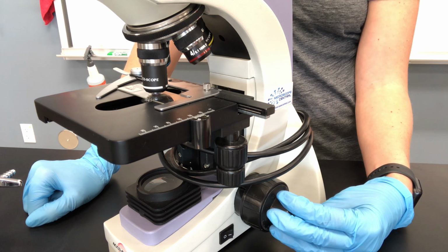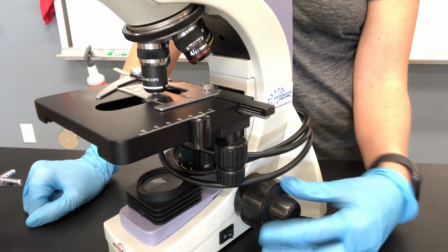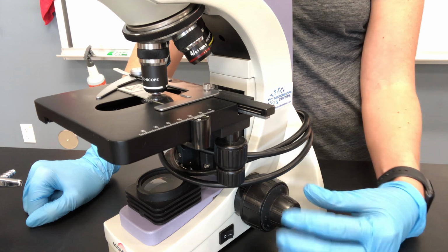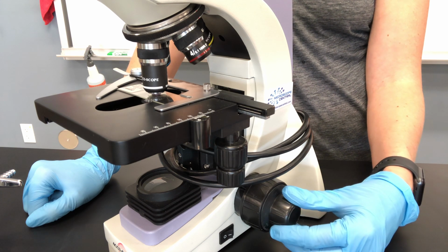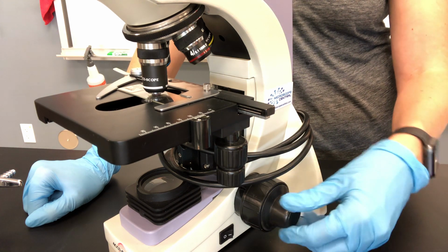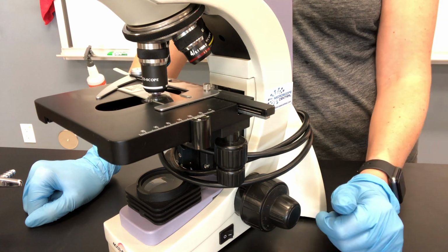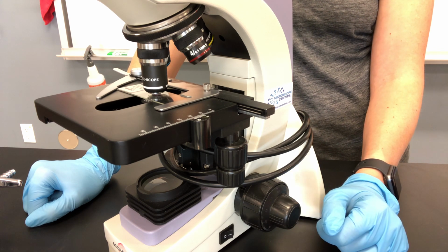If I can't get it in 3 full turns, then I stop. I go back 1, 2, 3. That's where I started, and then try going in the other direction. 1, 2, oh, there it is. And then you usually find it within 3 twists, either away from you or towards you from that initial starting position. Okay? So then that's how you do oil immersion.